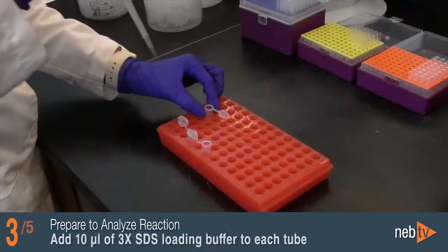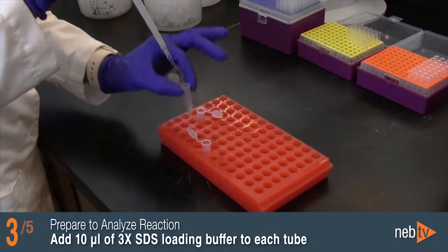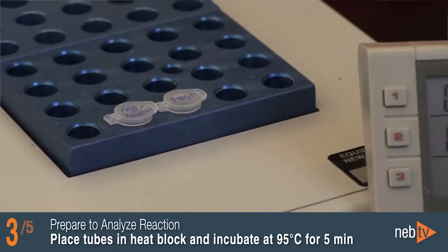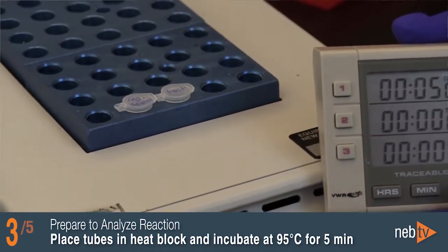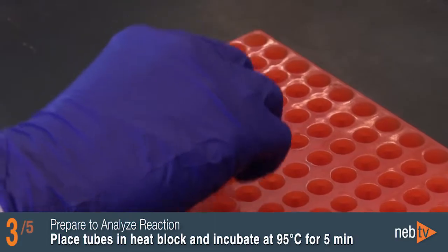After the Rapid PNGase F reaction is finished, add 10 microliters of 3X reducing SDS loading buffer to each tube. Place the tubes in the heat block and incubate at 95 degrees Celsius for 5 minutes, then allow the reaction to cool down.